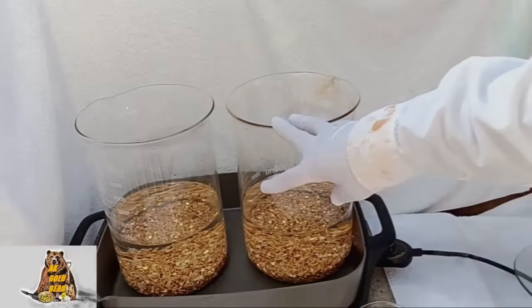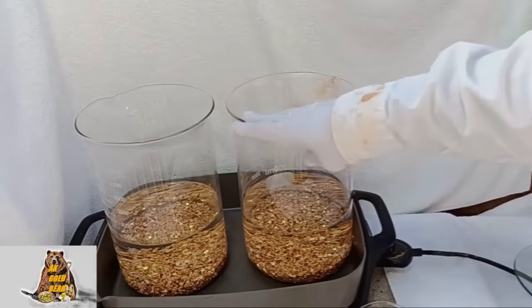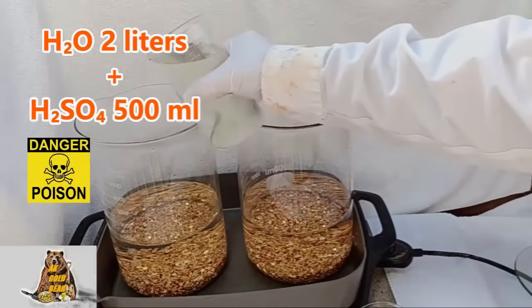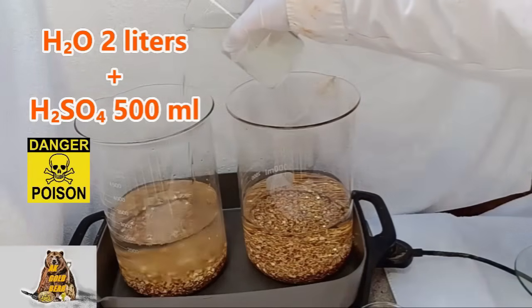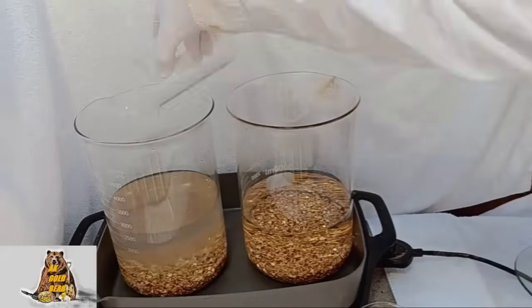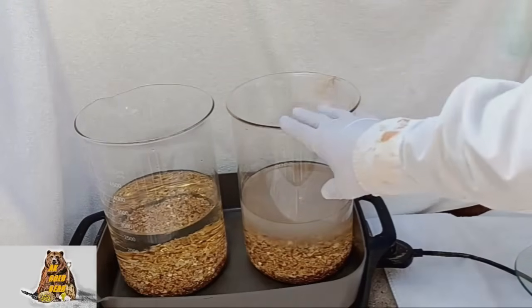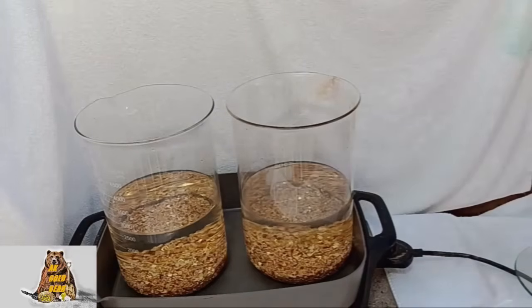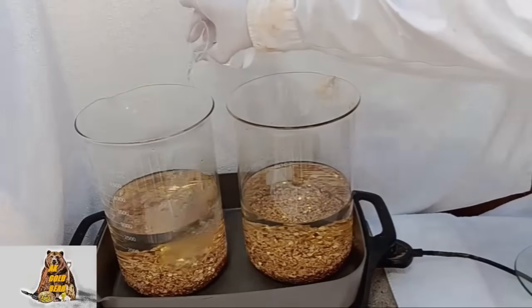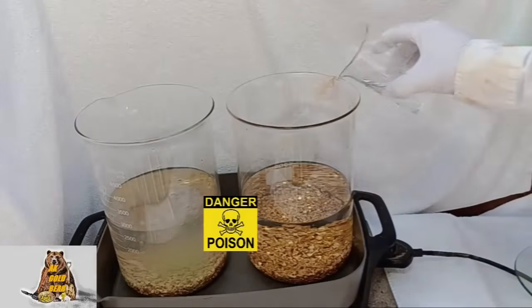I will dissolve the base metals with electrolyte since the connectors are magnetic. In the beakers I have 2 liters of water, and now I need 500 ml of sulfuric acid — 1 to 4 ratio. Now in my beakers I have electrolyte. And now I need to add 100 ml of nitric acid. No need to hurry.